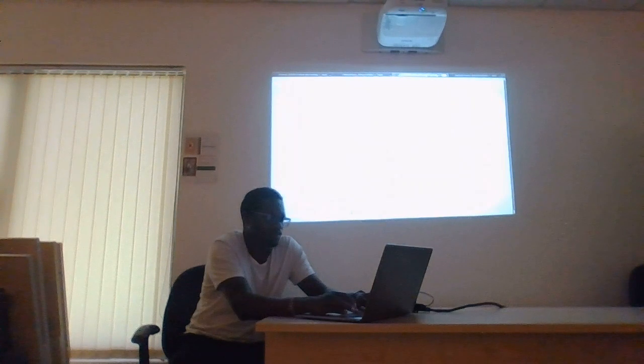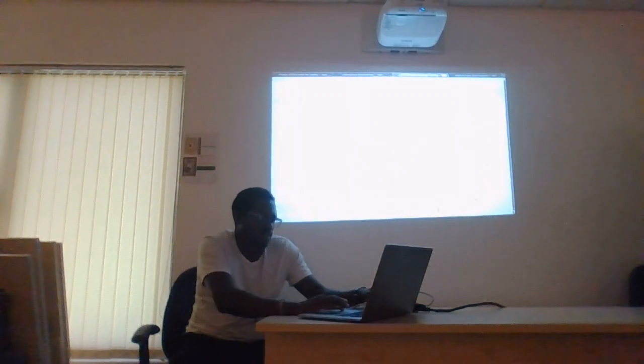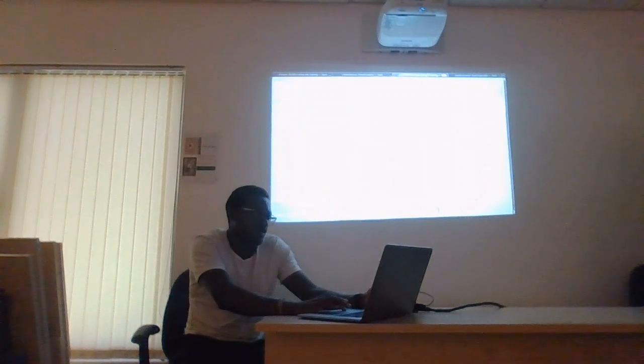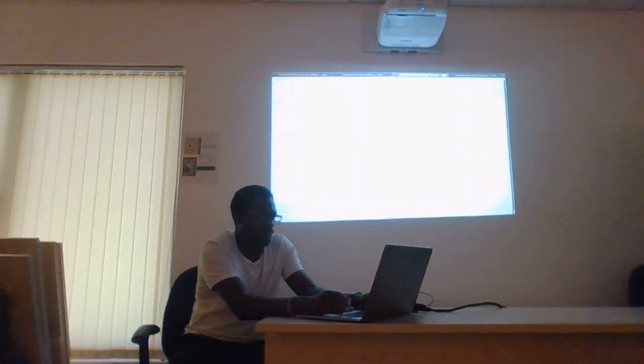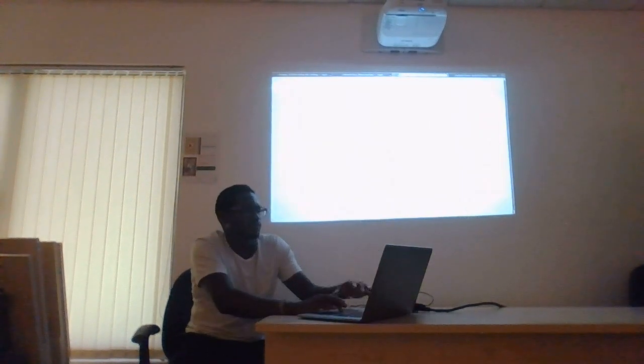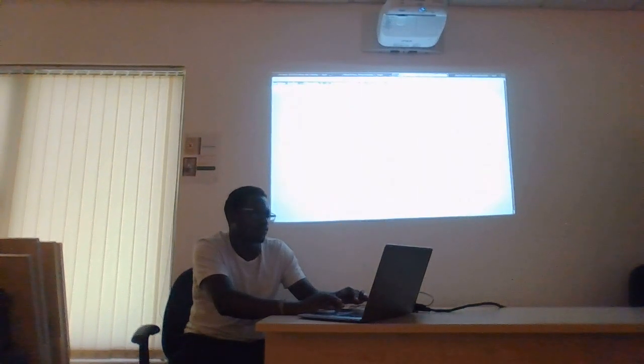Yeah. So I think I'm looking in there. Yeah, so if you list all, including the hidden files, you will see whether there was an error, the output, the command that was running. So you can have a look at it. The command that was running is just a simple sh script. So you can see this is the command that was running. It made use of one CPU and all the other arguments that are required.